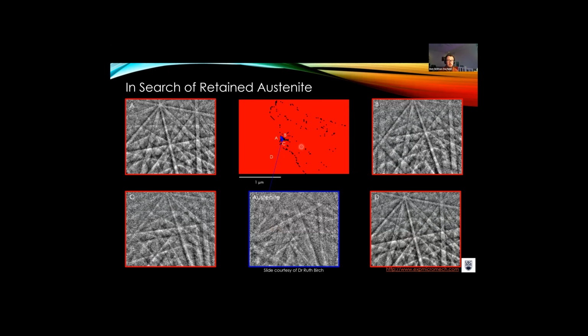But what's very cool is that we can confirm that we have pockets of very, very small austenitic regions. And we can do this by directly looking at the transmission Kikuchi diffraction patterns. So the regions that we have here, we have the red that shows the ferritic regions, and we can confirm that they're ferrite TKD patterns. And then we can use the software to help us in this process in an automated manner. We can see that the austenite is a very different crystal structure due to the intensities in other bits.